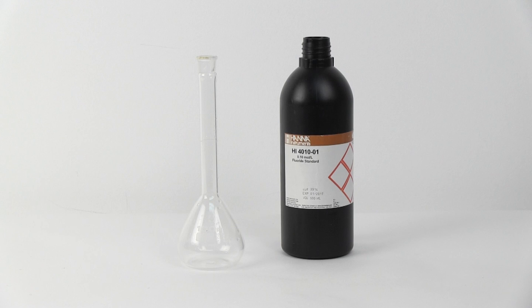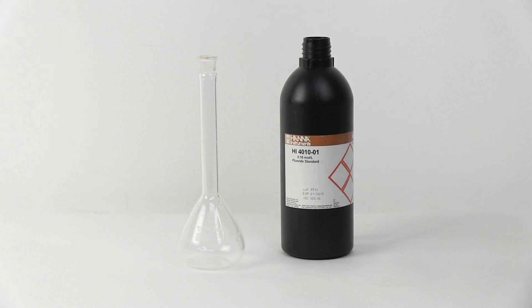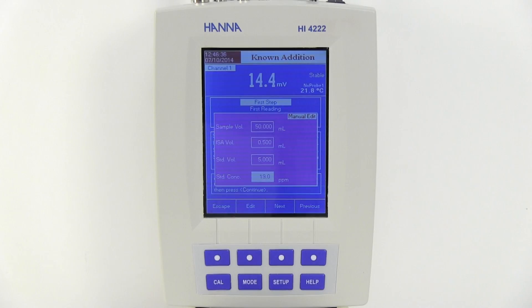The 19 ppm standard concentration is derived by taking the HI4010-01 0.1 molar standard, which is equivalent to 1900 milligrams per liter, or ppm. A 1 to 100 dilution is made by adding 1 mil of the HI4010-01 to a volumetric flask and filling to the 100 mil mark with deionized water. These parameters should be set by the user to reflect the volume of standard, ISA, and standard concentration to be utilized in their incremental method.